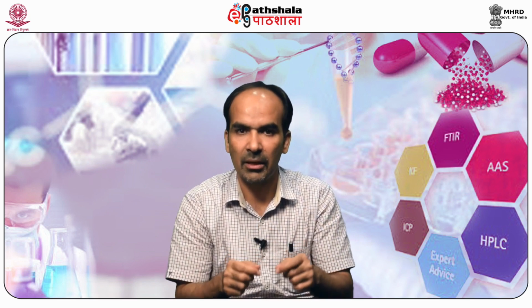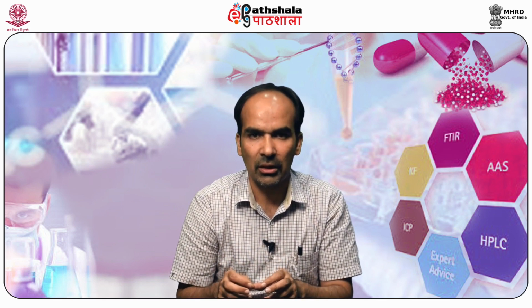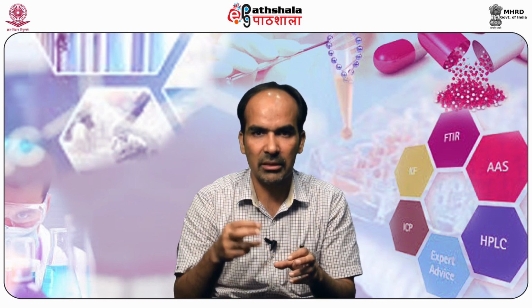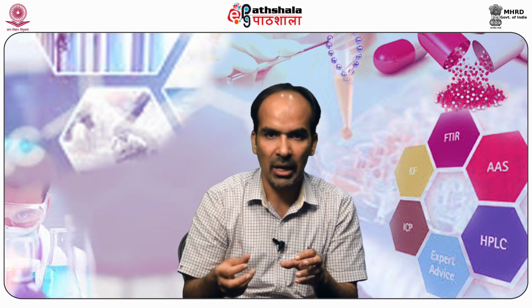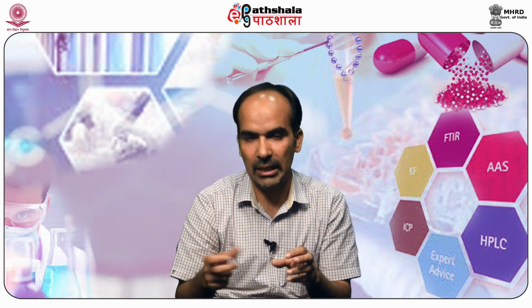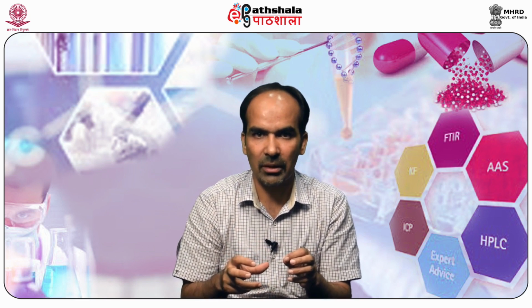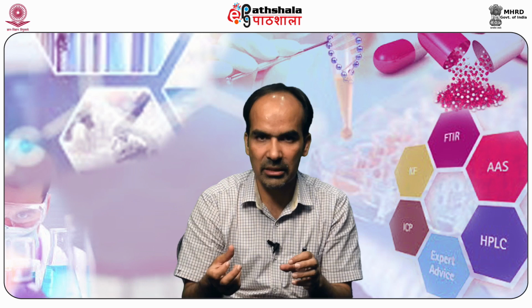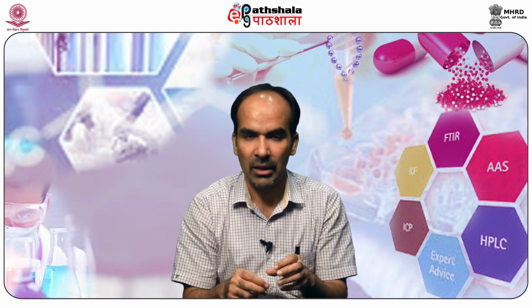UV is the most sensitive spectroscopic method that is used for their analysis, and over a period of time this has improved several folds. The technique has improved, and that has made UV spectroscopy even suitable for trace analysis. In the case of IR, Fourier transform IR spectroscopy has far greater sensitivity and far more rapid speed of measurements.